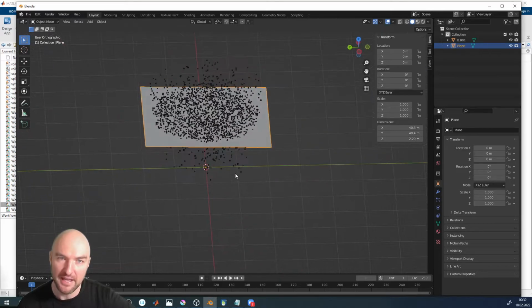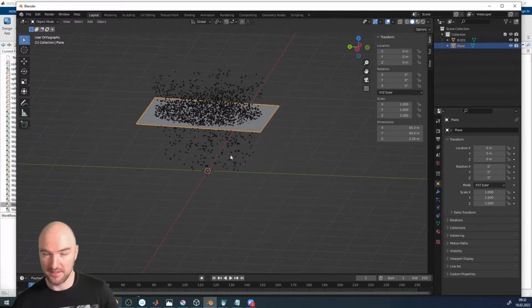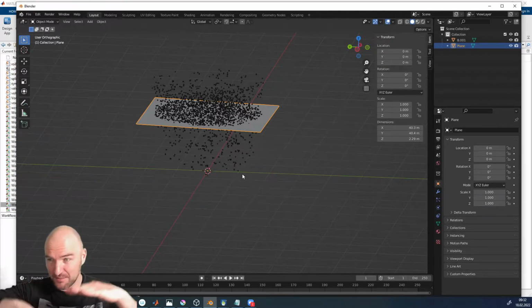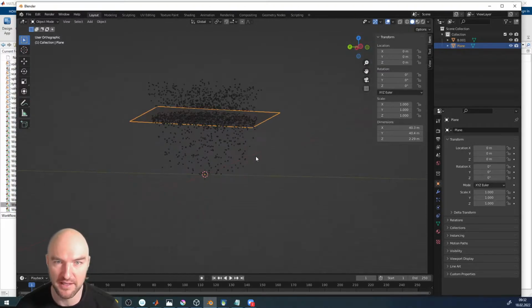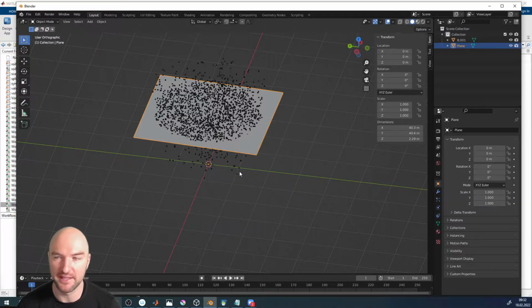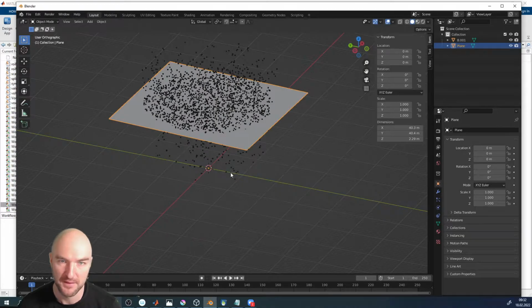And also maybe this is just us looking at it and creating the grain boundary, so we don't know if that's the best fit ever. Yeah, maybe locally it needs to be fit a bit better. But this is a starting point. So the question is now, how do we refine that? How do we make a really nice grain boundary model out of it?